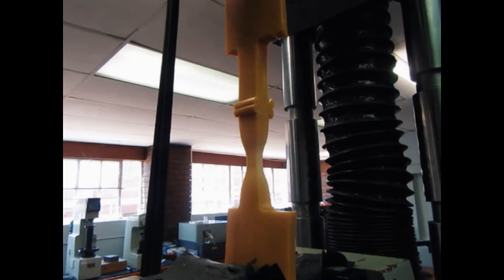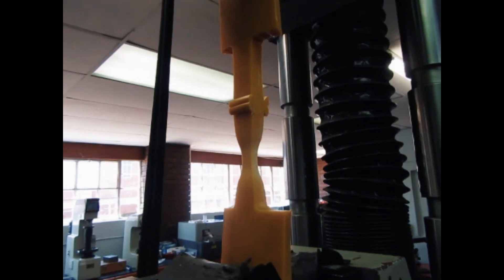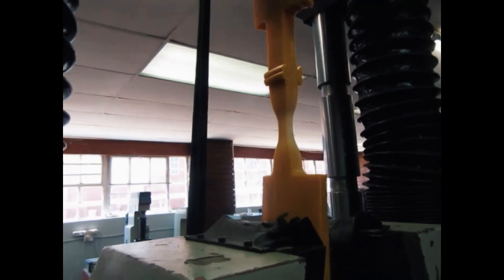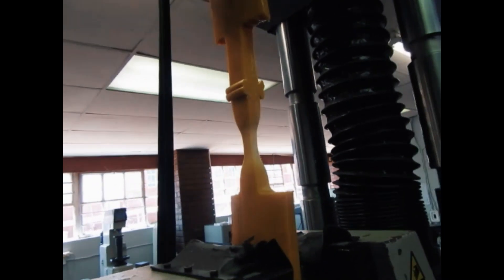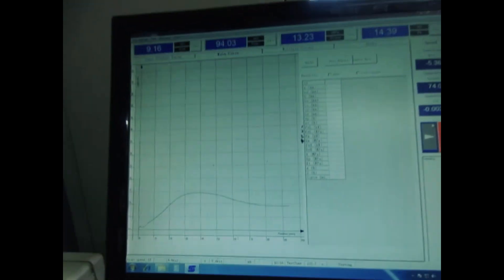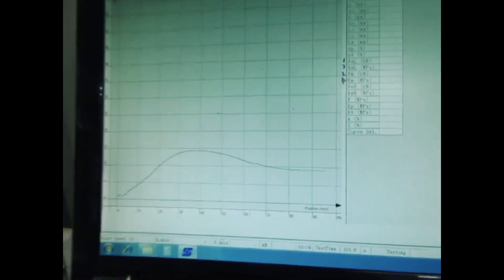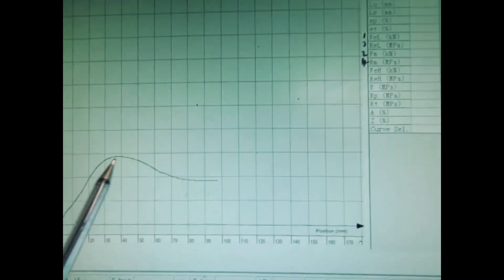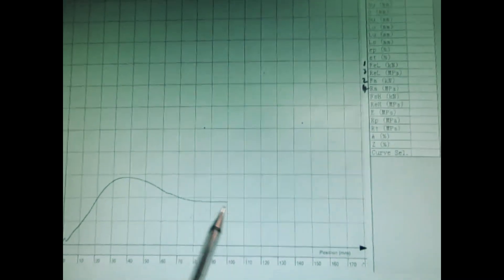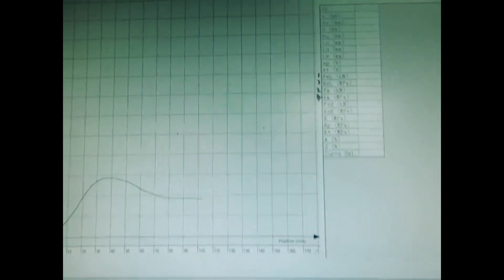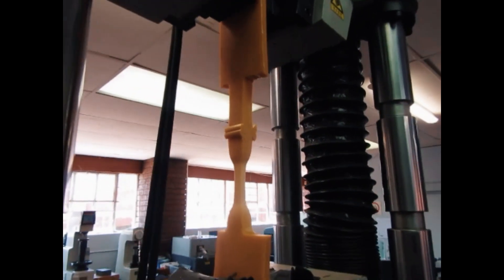So I think I might as well stop the pulley. I might as well stop the test because I've reached my maximum load. Check out my graph. I've reached my maximum load there, and here it's just gonna be constant. It won't help me that much if you check out. It's just going and going and going.